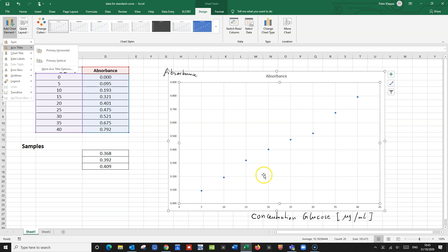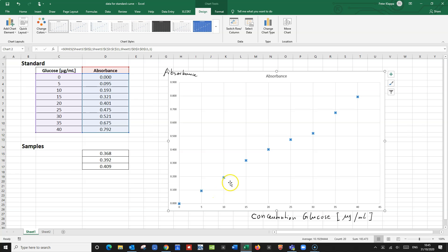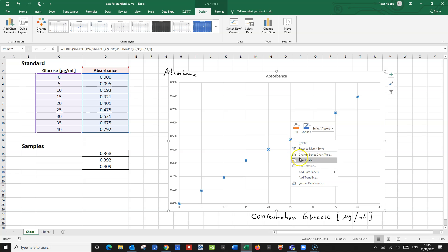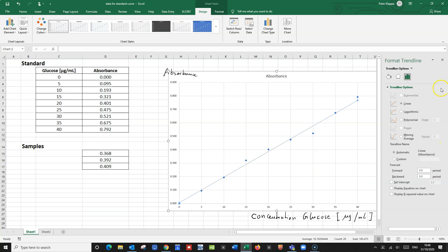We would really like to have a nice curve with a line in it so that we can relate our sample. The way to do that in Excel is you just left-click on one of the data points — they all get activated. Then you right-click on one of the data points, and you see another menu come up. Where it says 'Add Trendline,' click on that, and you come up with a new window. It automatically adds a line of best fit, and it looks pretty good.